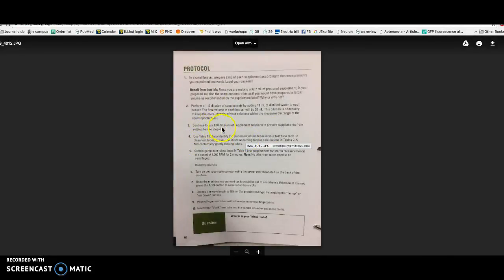You made a 1:10 dilution of the supplement, right? Whatever math you did to know the amount of supplement you need was for 2 ml of the solution. But then later you did a 1:10 dilution. So you actually diluted the serving size 10 times, right?